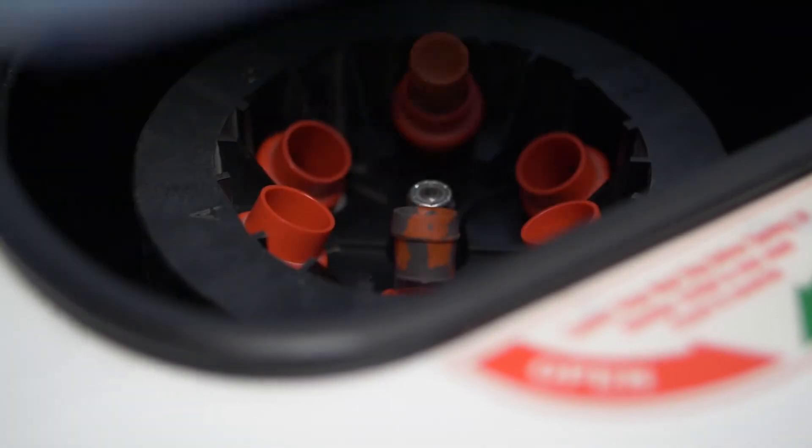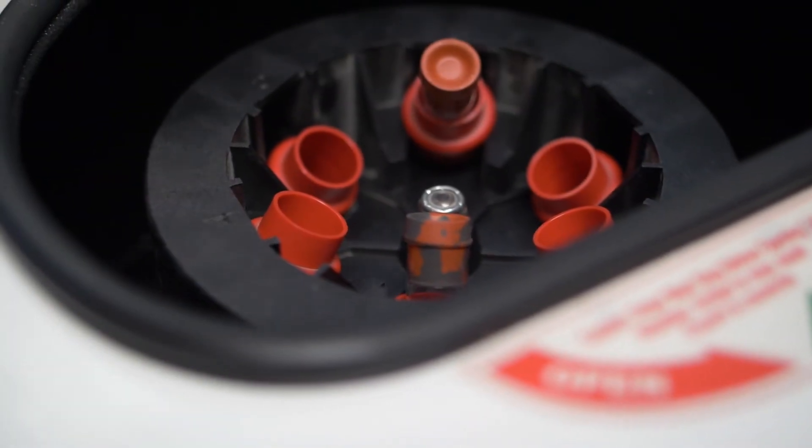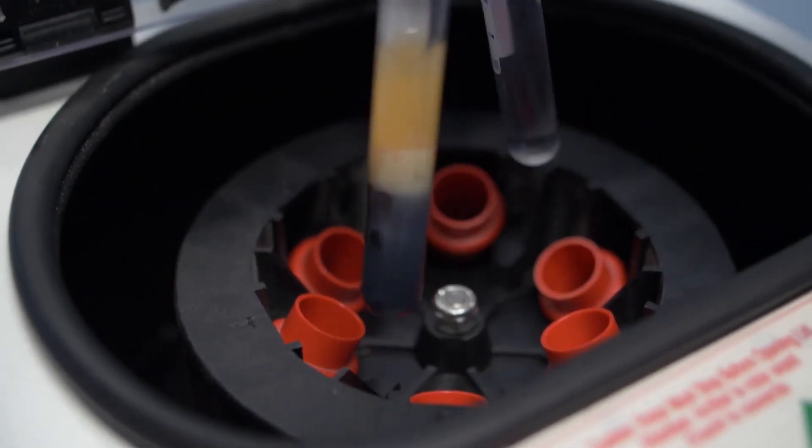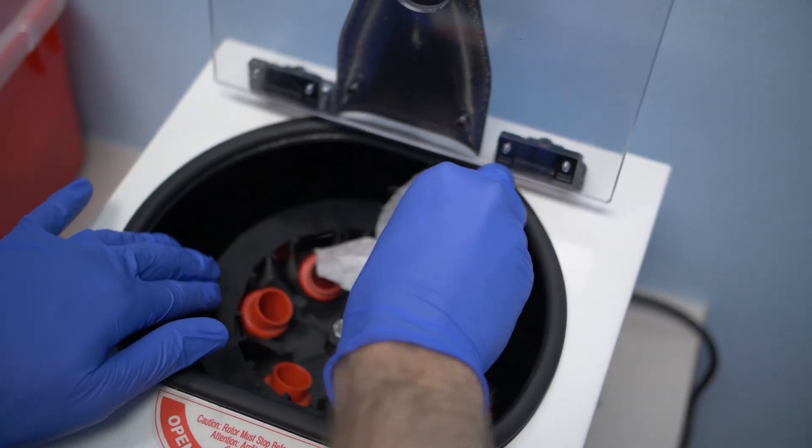Larger centrifuges can spin at very high speeds and are extremely dangerous if they become unbalanced. Open the lid only after the rotor has completely stopped. Gently remove the tubes so that the separated suspensions do not mix again. You also want to check and see if the samples have leaked or if any of the tubes have broken.